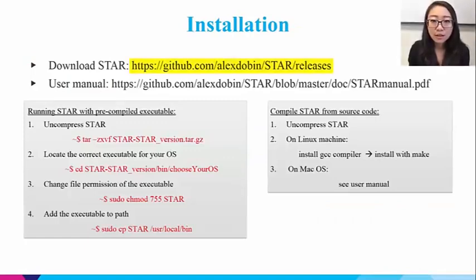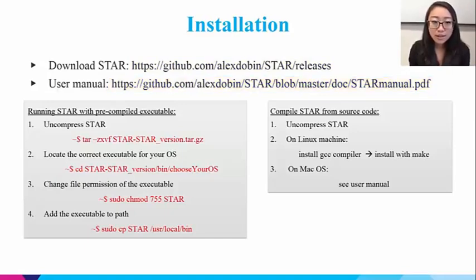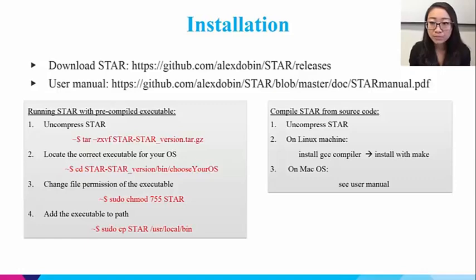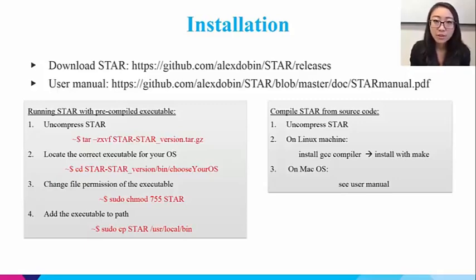First, let's install STAR. This is the GitHub repository for the current release of STAR — we'll download the source code. The STAR user manual can be found at the listed URL. It gives detailed instructions on the usage of STAR, its parameters, mapping strategy, and troubleshooting information. Once we download the source code, we need to first uncompress it in the desired directory. After decompressing, we can see subfolders for binaries, documents, source code, and other files. The pre-compiled executables are good enough to perform STAR runs and come with Linux and Mac versions. We just need to change the file permissions with the chmod command and copy the executables to our local binary folder, which will allow invoking STAR from any directory. Alternatively, if you prefer to compile STAR from source code, you can use the make command on Linux. It's a bit tricky with macOS — I suggest you read the user manual for the details.